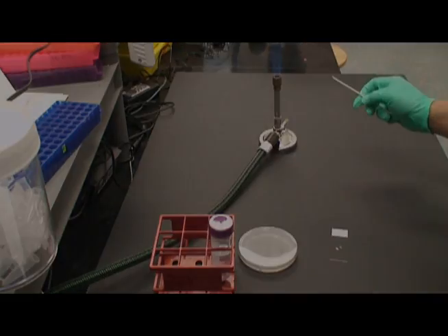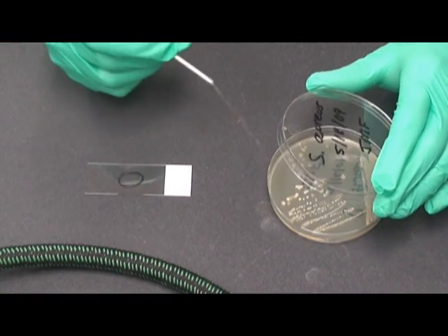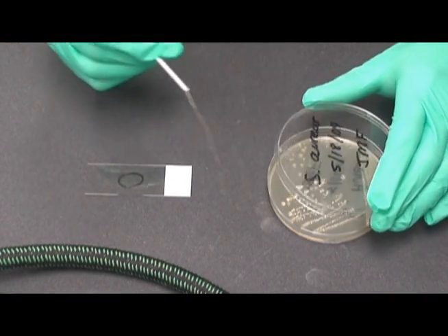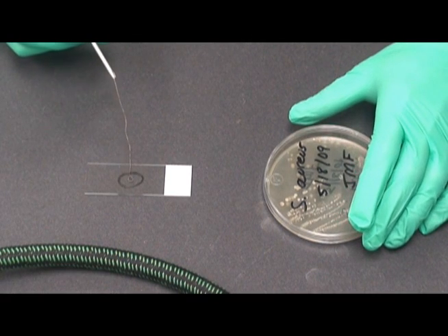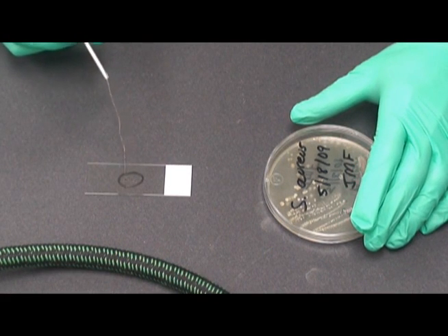Once again, sterilize the inoculating loop and after allowing it to cool, remove a small portion of one colony of bacteria from the plate and smear the bacteria together with the water.